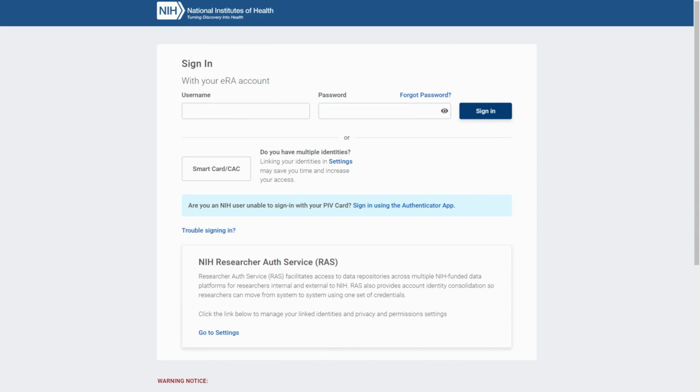If you do have access to controlled data, so you don't actually need to have access to any of the controlled data sets such as TOPMed, etc. But you do need an ERA Commons ID to be able to use that to log in. When you log in, and if your dbGaP credentials do give you access to one or more controlled and hosted data sets, the platform will give you a quiz to make sure you understand how to appropriately use controlled data on the platform.